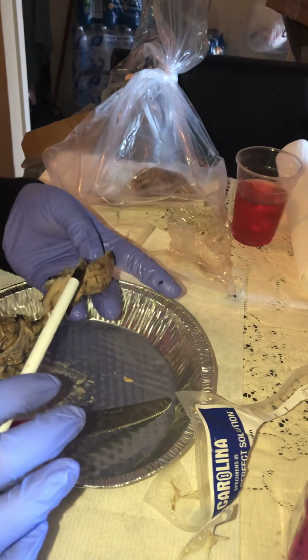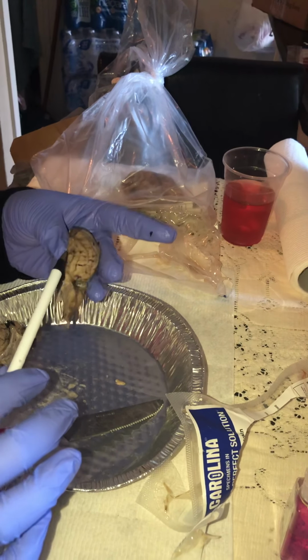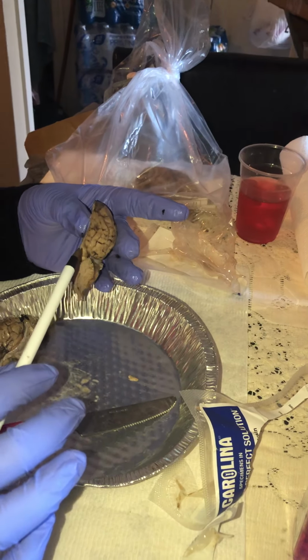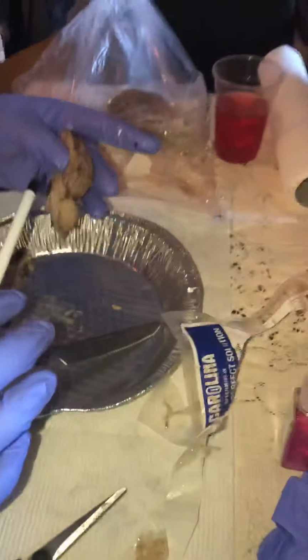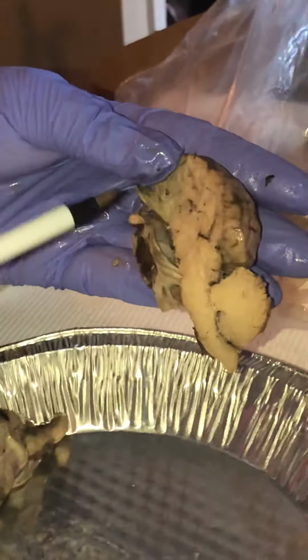We talked about the cerebral cortex. I just want to make sure I got everything. The lateral ventricle is right here, okay?